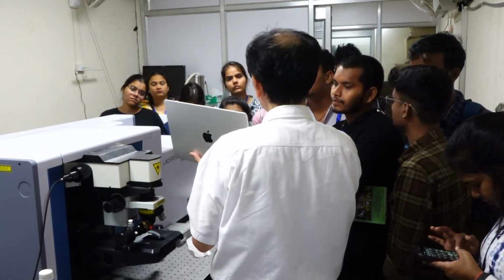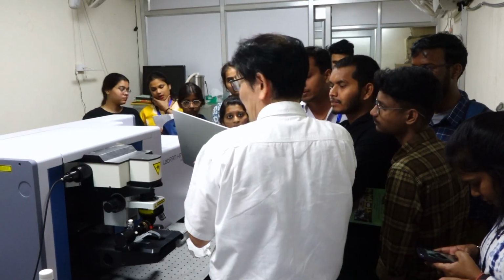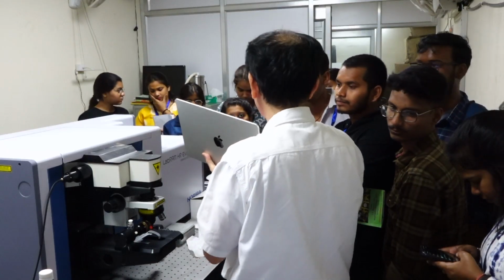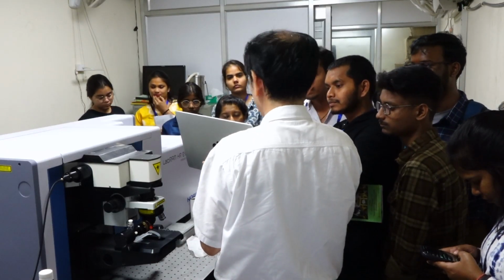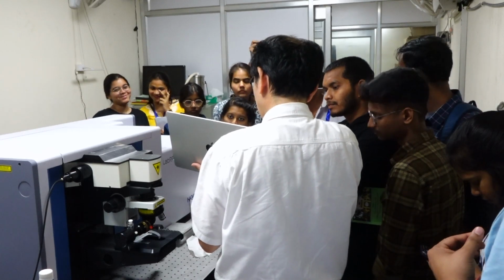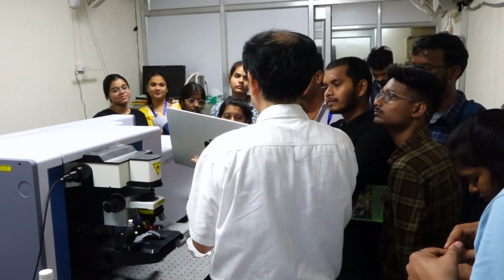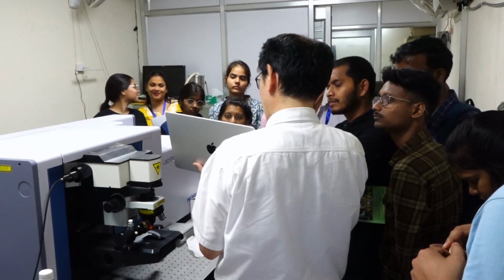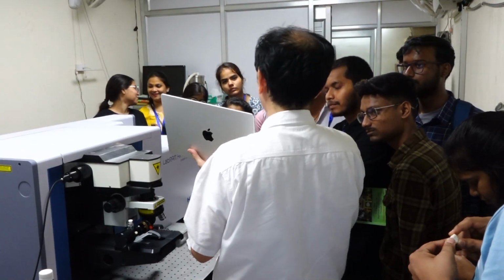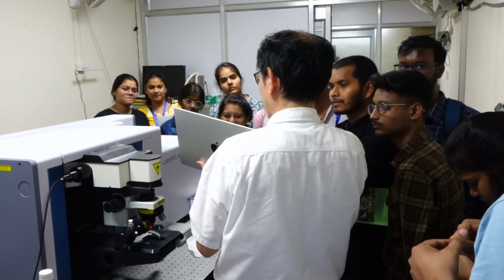This can also show the number of scans, and how much time: a 6-second exposure and 4 times accumulation, 24 seconds. Okay, already this is good enough to distinguish. So it depends on the purpose. If we want to distinguish which is fructose and which is glucose, say I want to add fructose to my cooking, then it's easy to use a Raman spectrometer to identify which is fructose.